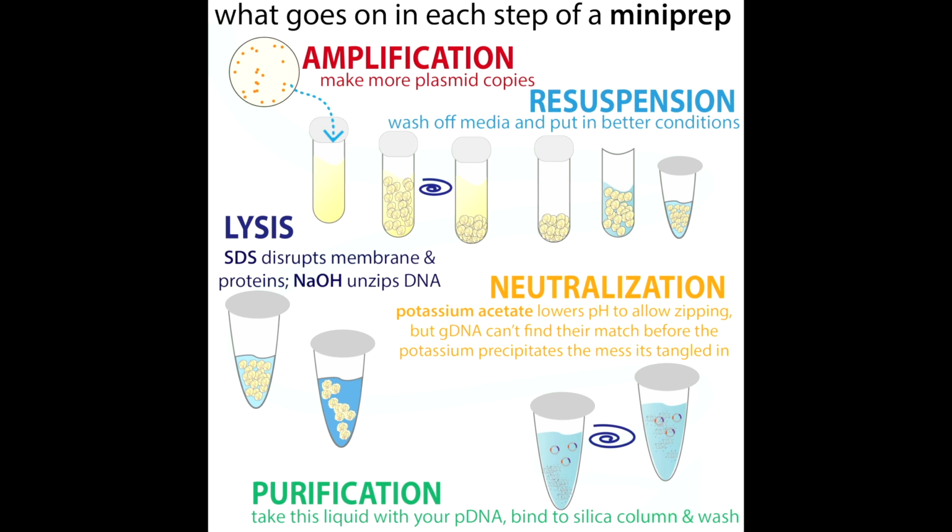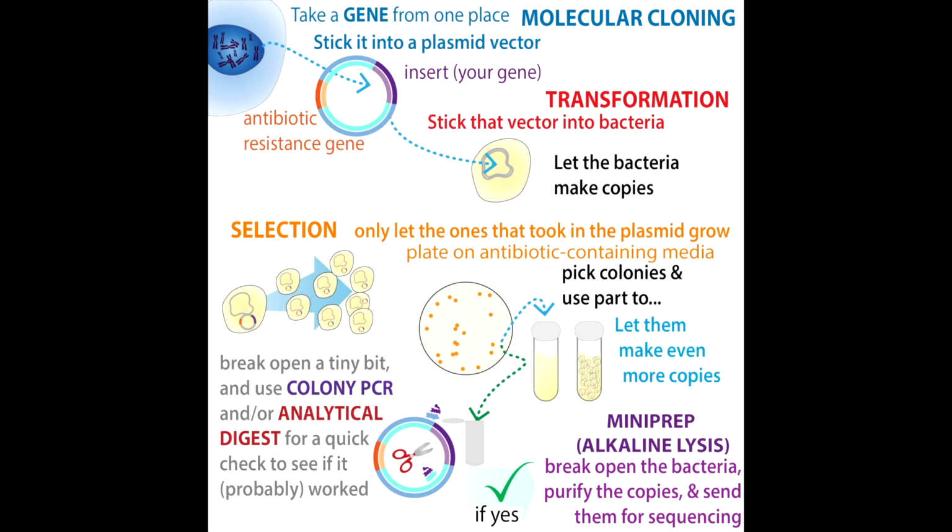So now you have your plasmid, but you have two questions. Is it in there? And is it actually right? So there are a couple of ways to check if it's in there.